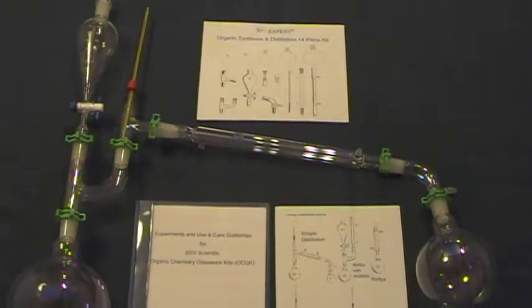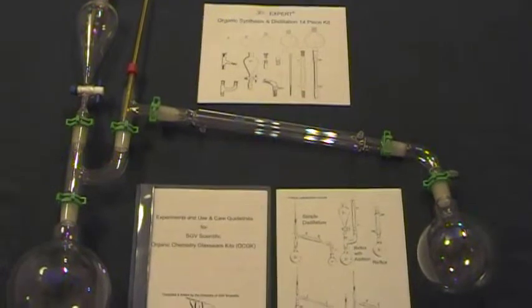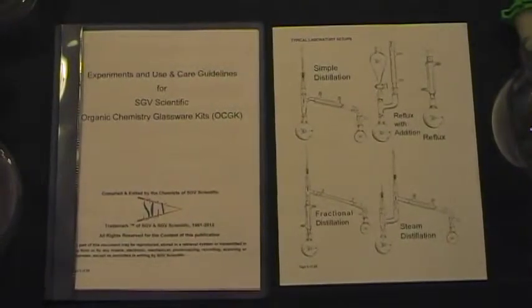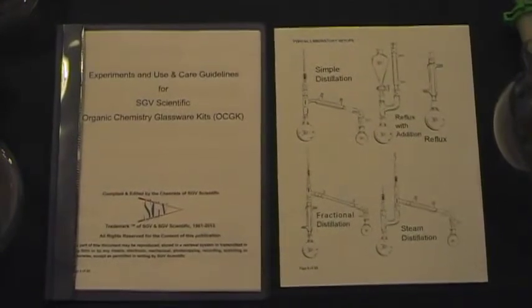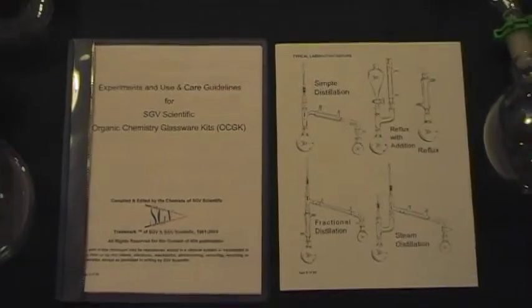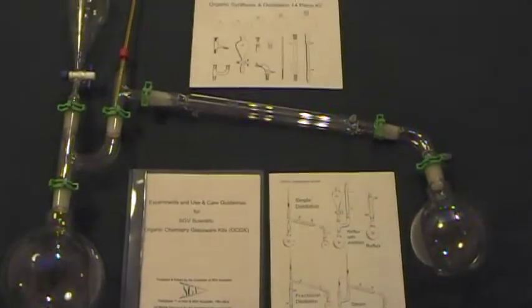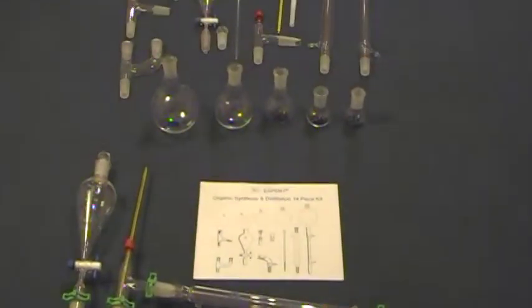In this experiment booklet we provide instructions and detailed procedures including graphics and pictures for performing organic synthesis, distillation, separation, and other organic chemistry preparations. This booklet provides practical help on how this glassware should be assembled and used properly, and the proper precautions that need to be followed to ensure safety. Along with this, we also provide web access to one of the most comprehensive synthesis formularies that references over 5,000 procedures. It is considered to be one of the most detailed, reliable, and carefully checked procedure repositories for the preparation and synthesis of organic compounds.